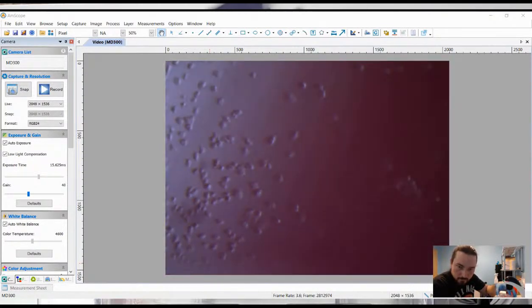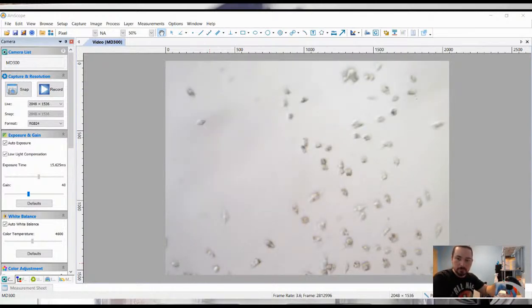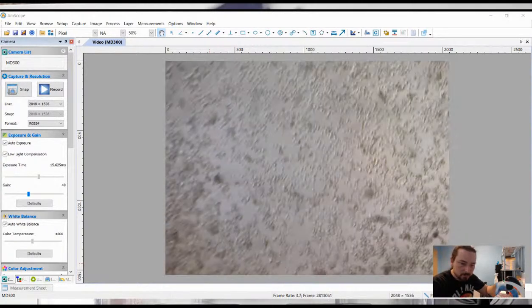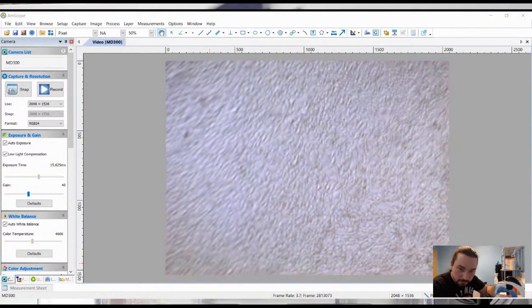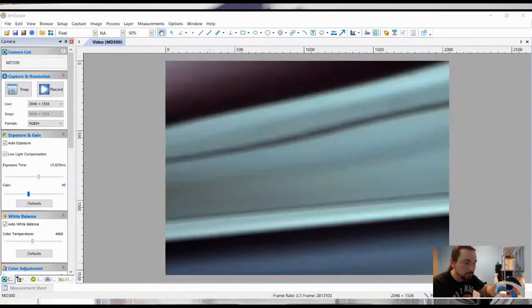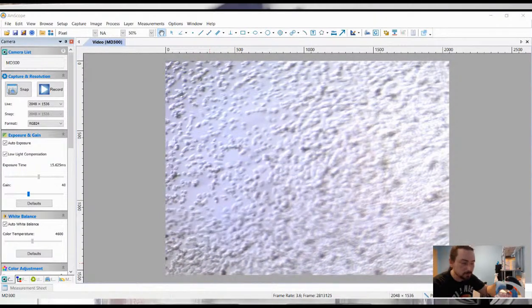A little less blue. You get bluer over time. But also when you're super zoomed in, it's hard to see. Just focus. Yeah, hard to see, but you can see they're blue. You can compare that to controls, right? You can see the transformation itself is hard on them, but that's the negative control for that one. Got the same amount of X-Gal solution and everything. They're just growing better. But they're not blue. And this one, blue, but it's also pretty damaging.